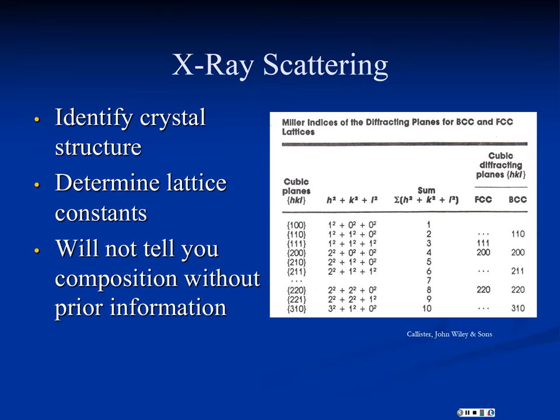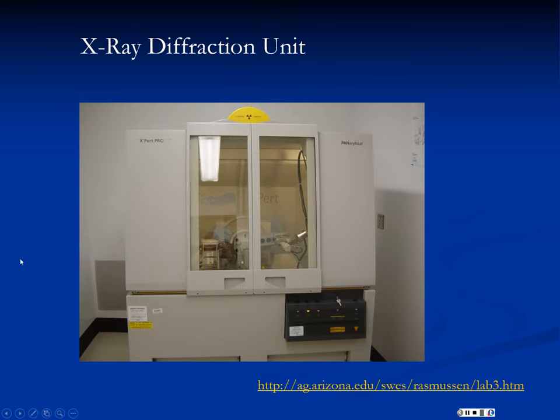And X-ray diffraction, XRD, won't give us that. Now, modern XRDs are not very exciting. They look like a telephone booth. Rather than having the detector on a big track and a goniometer, the sample sits in here and is rotated and the beam source is kept constant, and then you have a detector off to the side. And as you rotate the sample, very precisely using modern instrumentation, you can then measure the angle of diffraction. So kind of boring looking anyway, but that's what a modern XRD looks like.